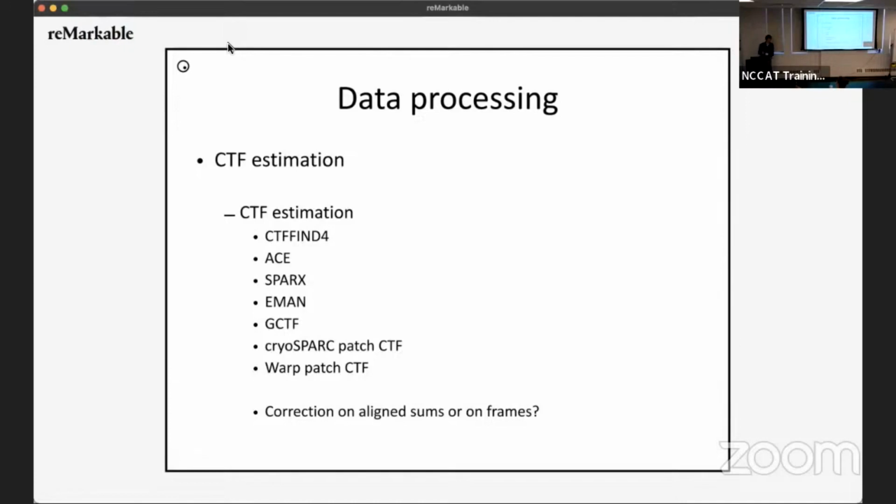And so you could potentially get to a point where you basically set your defocus and know it very well by doing maybe multiple defocus points around your image, something like that. But in some ways that would be extremely time consuming and not really useful because you can estimate your defocus pretty accurately straight from the micrographs.